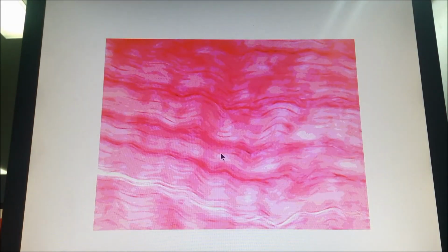Over here, collagen bundles, dense, regular or irregular? Regular. مش ضروري الريجولار يكون straight. Regular means parallel, that's it, in one direction. يعني هون they are wavy, okay, but they are still all parallel. Honestly, most of the time this is what you're going to see. You're not going to see straight collagen bundles. You're going to see wavy, undulating collagen bundles. But this is definitely regular. Regular equals parallel, not straight. أهم شيء إنهم يكونوا in one direction.